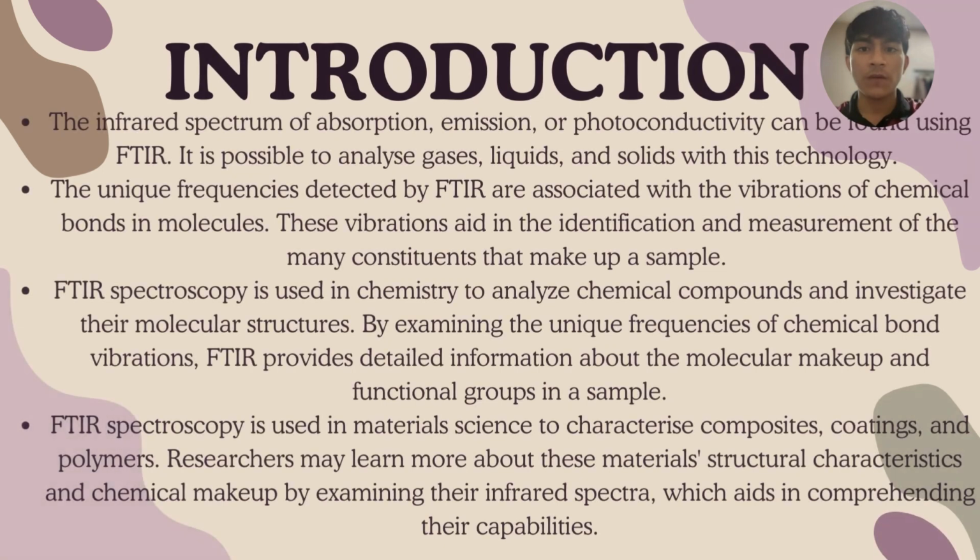The infrared spectrum of absorption, emission, or photoconductivity can be found using FTIR. It is possible to analyze gas, liquid, and solid with this technology. The unique frequencies detected by FTIR are associated with the vibration of chemical bonds in molecules. This vibration aids in the identification and measurement of the many constituents that make up a sample.